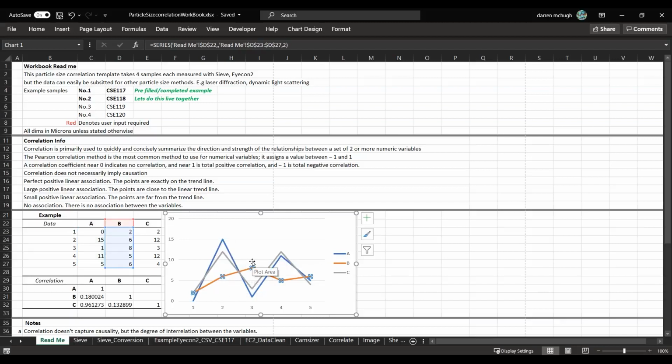What we can do once we have all the data populated is do a correlation analysis in Excel. I suppose this is a good point to mention, this doesn't have to be done in Excel. It's whatever package you're familiar with. Maybe you have a preference in your company, such as MATLAB or R, or along those lines. But I'm familiar with Excel, and it allows me to break down the analysis a lot more to the fundamental levels like this. So the first formula is just CORREL, if we can see that up here.